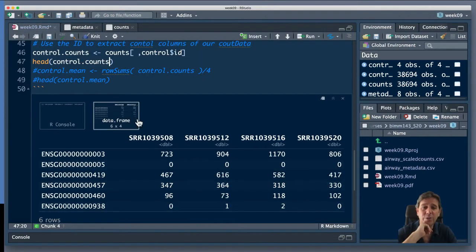So what am I going to do with this? How do we summarize this work? These are multiple replicates, or actually biological replicates. They're different cell lines, in this case. So what I want to do is summarize them. How would I summarize them? Well, one easy way is just to calculate the mean across these control experiments, and then I'll do the same for the drug treated. I'll calculate the mean of those, and I'll compare the means. And if the means are different, then they're different. I can calculate the p-value for that, significantly different, these sorts of things. That's one way to compare it.